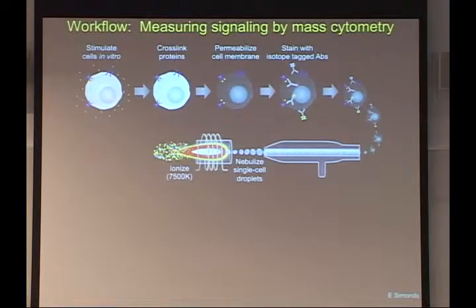And it's net neutral, but it's very, very high energy. So it's about 7,000 degrees Kelvin, surface of the sun. So as every cell goes in there, or anything goes in there, it's completely vaporized, and most of its elemental components are ionized to the first ionization state.